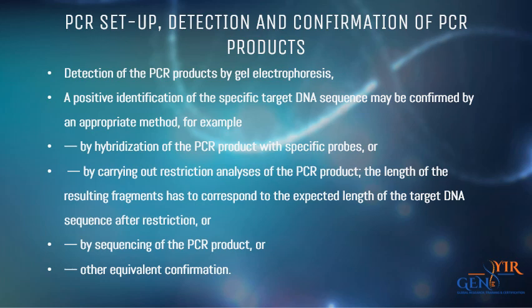If the primers used are designed to detect sequences derived from infectious organisms, a naturally occurring non-genetically modified organism such as a virus or a bacterium, then it is highly recommended that it be verified that the detected DNA is indeed derived from a GMO. This can be done by checking for the absence of other DNA derived from the infectious organism.